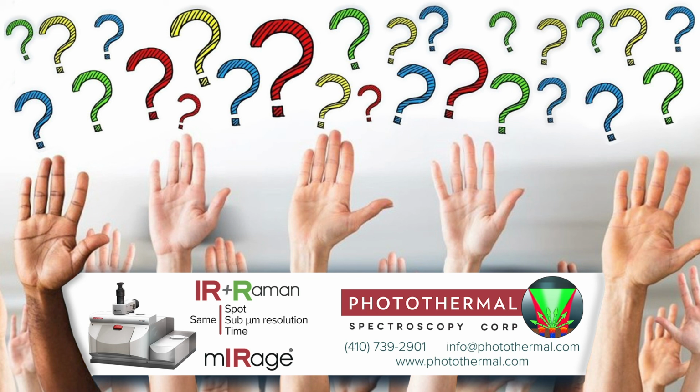Then this probably will have to be our last question. What is the depth of sampling? This is a common question, and one that I always think I should have mentioned during my presentation. Like many things in life, it depends on the materials being measured at that point in time. But as a general rule of thumb, I'd say probably a few microns would be your depth of sampling, or depth of penetration.